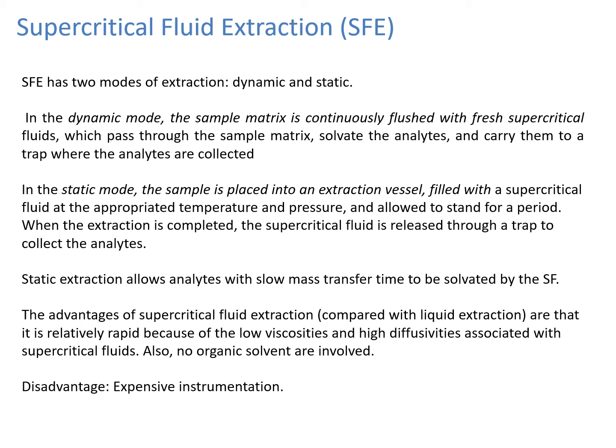While in the static mode, the sample is placed into an extraction vessel filled with supercritical fluid at the appropriate temperature and pressure, and allowed to stand for a period. When the extraction is completed, the supercritical fluid will be released through a trap to collect the analytes. Static extraction also allows analytes with slow mass transfer time to be solvated by supercritical fluids.